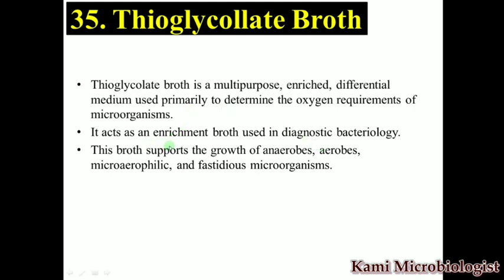This type of broth mostly supports the growth of anaerobes, aerobes, microaerophilic, and fastidious microorganisms. Anaerobes are those bacteria that do not need any type of oxygen, and the bacteria can grow without any oxygen.